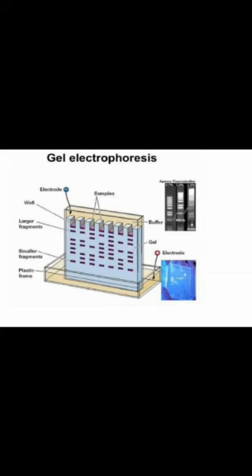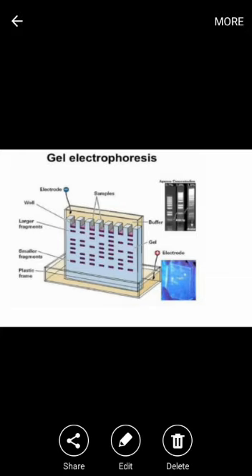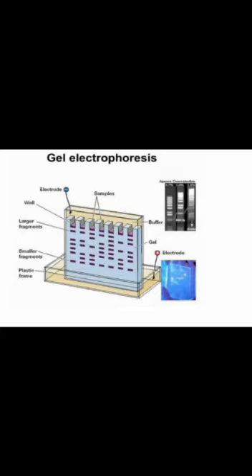Thus, when researchers want to separate proteins using gel electrophoresis, they must first mix the proteins with a detergent called sodium dodecyl sulfate.